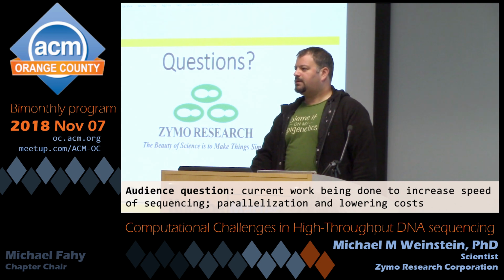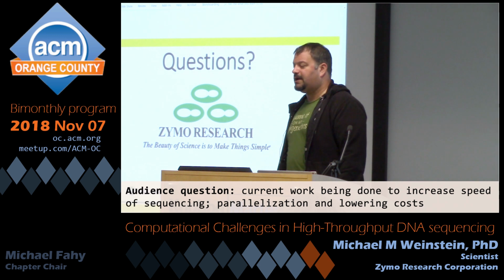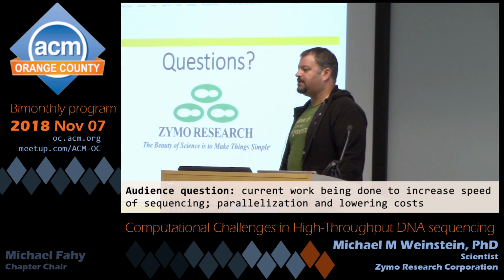So getting out that reference genome is going to be computationally expensive, but since it only has to be done once, and typically you're going to be doing a lot of alignment to it later, the cost of actually making the reference, of assembling the reference genome, pales in comparison to just all the alignment you're ever going to do against it. That's one of the reasons why aligners tend to evolve a lot faster than assemblers.